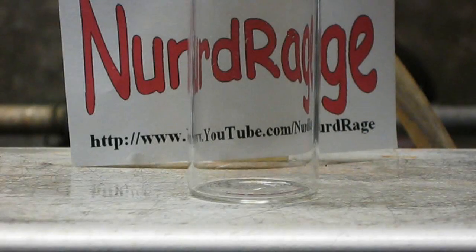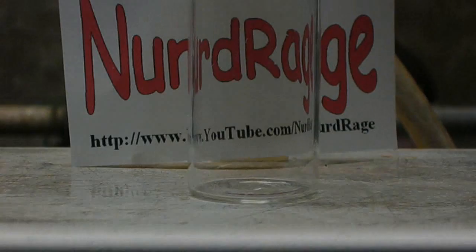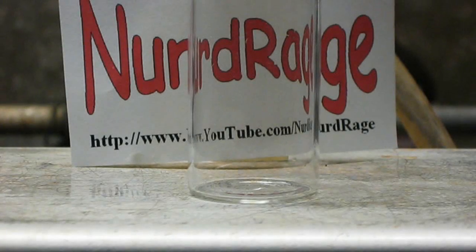Greetings fellow nerds. In this video we're going to make a thunderstorm in a test tube — or at least a bad copy of one. The procedure is dangerous, but deceptively simple.